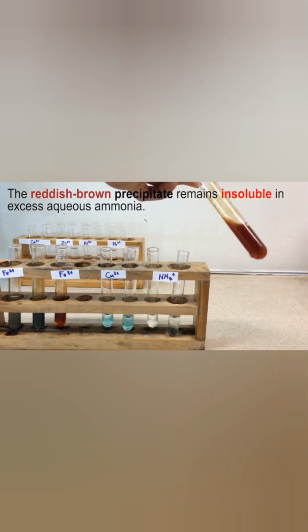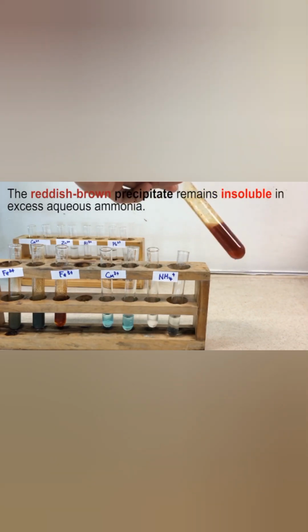Adding excess aqueous ammonia, the reddish brown precipitate remains insoluble in excess aqueous ammonia.